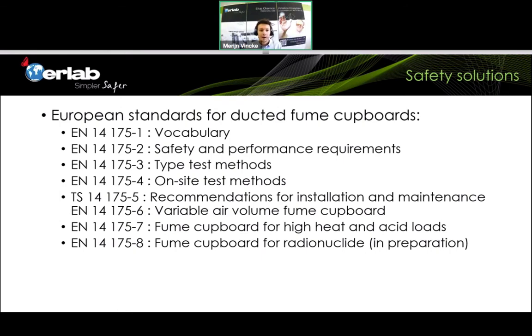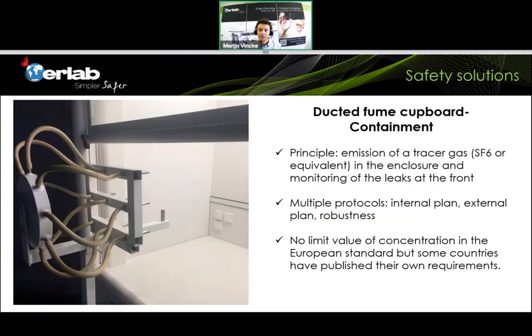Ducted fume hoods need to be tested in many ways. The European standard for ducted fume hoods is the EN 14175, and I'm sure that many of you know this standard. But there are many different tests that have to be performed in order to assure the safety, in order to minimize the risk. And so we're going to talk more about part 3 of this standard, which is about containment, a test that we perform about containment.